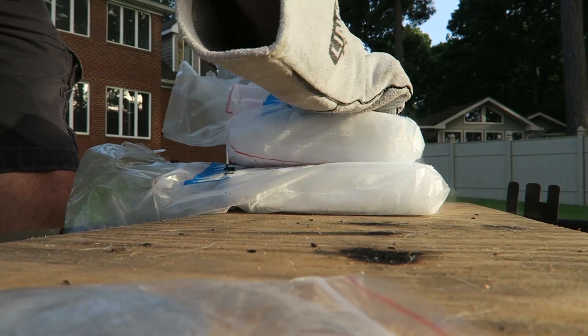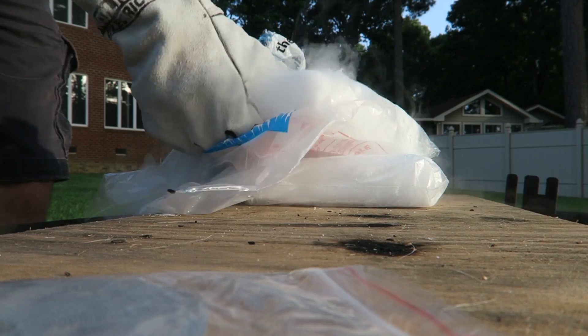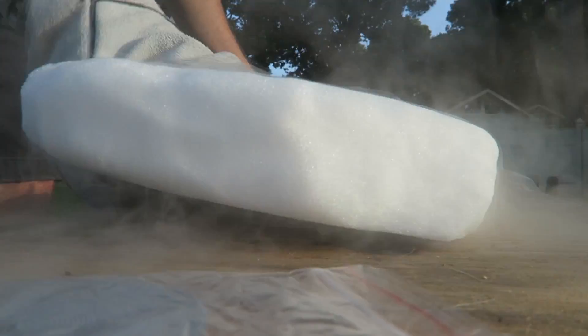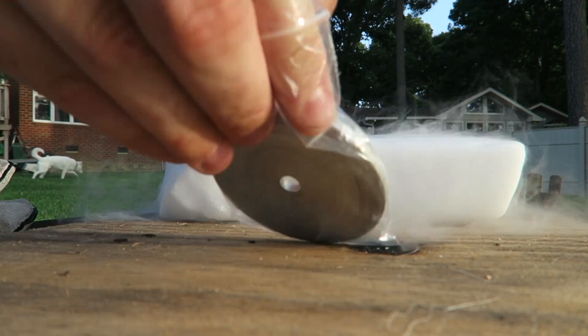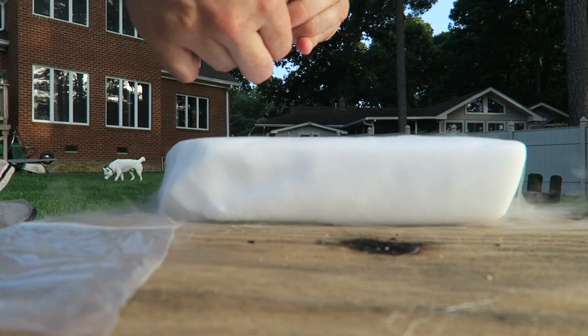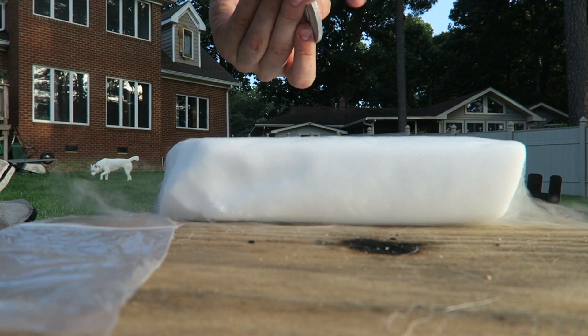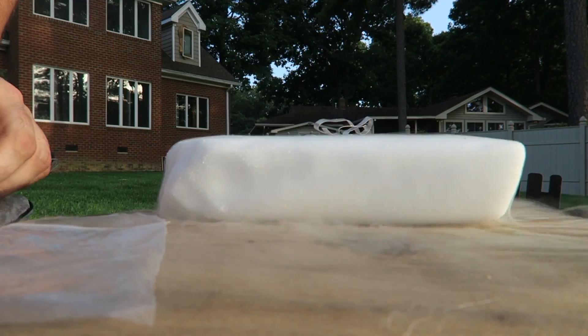First I'm gonna get the dry ice out of the bag — I got two blocks right here. Then I'm gonna grab the magnesium ribbon, break off a piece, and put it right into the dry ice.